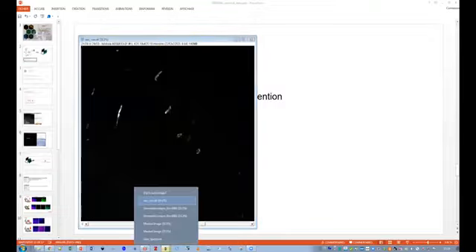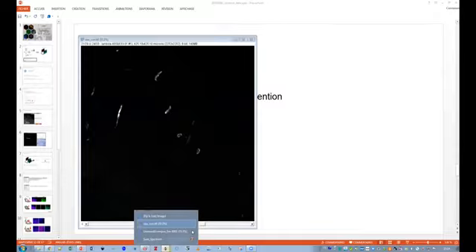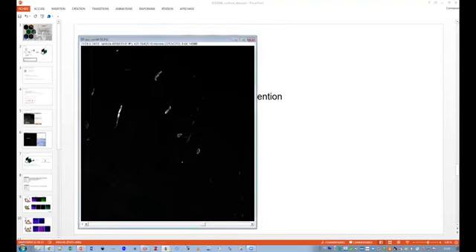Which maybe is what is done, because the spectra of each component looked a little bit, you know, it's not a critique. But this is what Juliette does with the ROI. Yeah, but does it correspond to how many pixels?